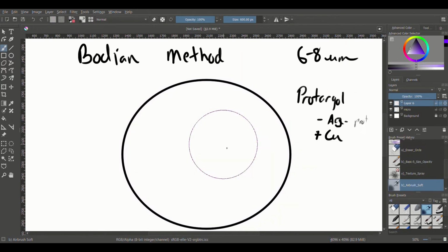The next stain that we're going to look at is the Bodian method. The Bodian method is a silver technique that we are going to use to stain nerve fibers. Like I said before, we're going to have some silver techniques to do special things, and you're going to want to remember what makes them different.